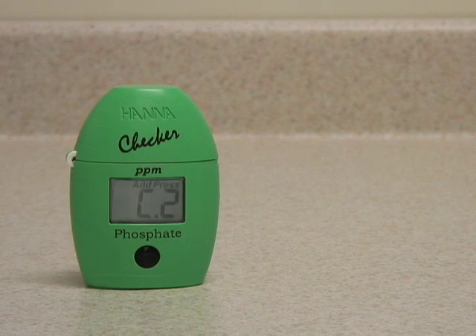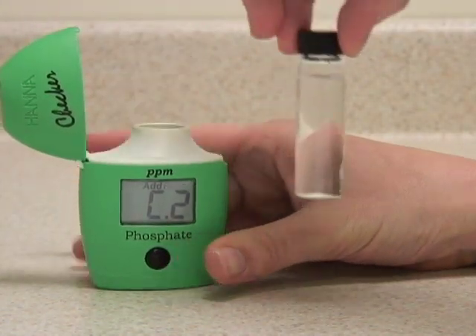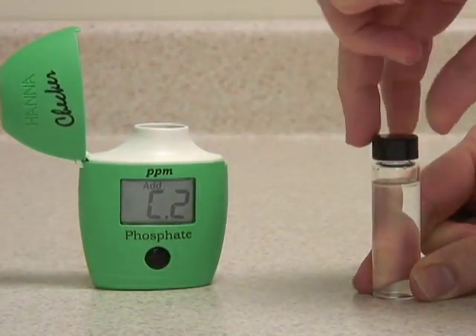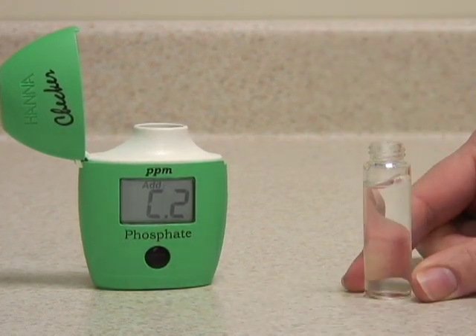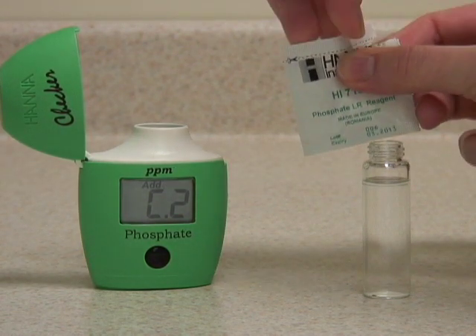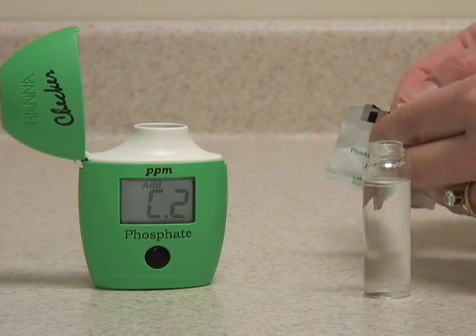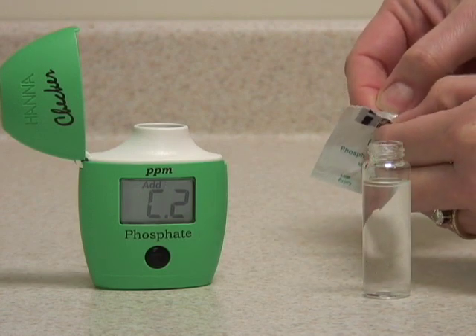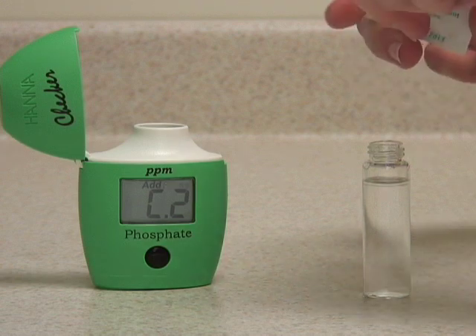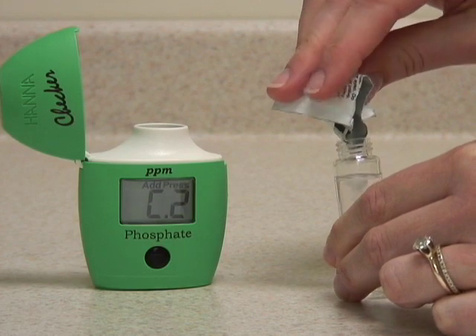When the meter displays C2, add your reagent to this same vial. Try to avoid touching it with your fingers in the middle, as fingerprints could alter the reading. Take your Hanna Instruments Powder Pack for Phosphate and pour the powder reagent into the vial, getting as much in as possible.